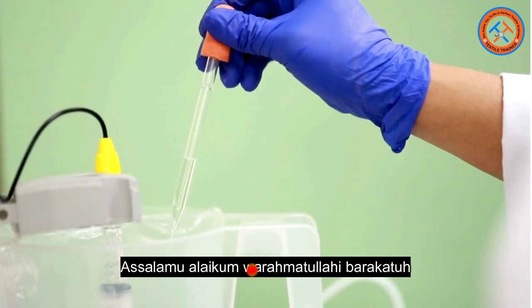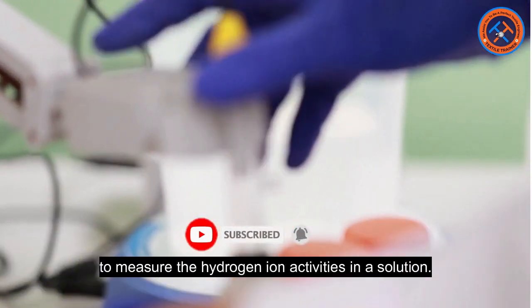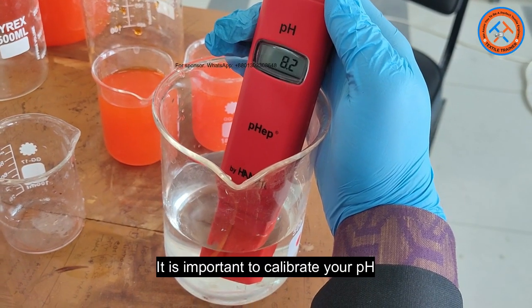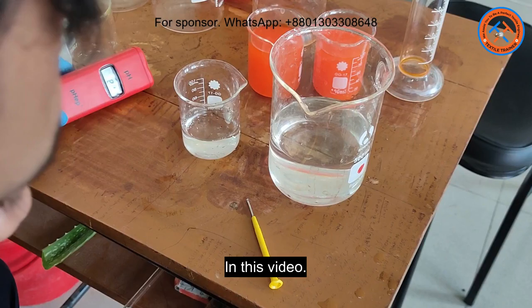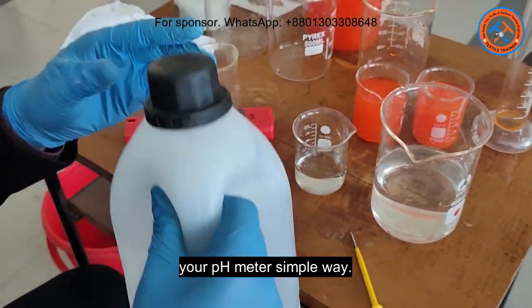Assalamu alaikum warahmatullahi wabarakatuh. A pH meter is an instrument that is used to measure the hydrogen ion activities in a solution. It is important to calibrate your pH meter on a regular basis, but it depends on its use. In this video, I am going to show you how to calibrate your pH meter in a simple way.